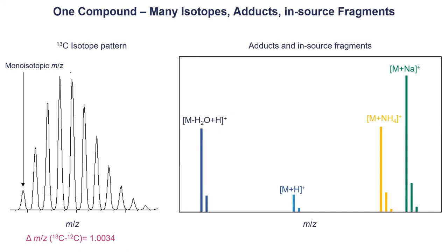And this is also something we need to be aware of, because if you think about it, you have some settings in your spray, like a high temperature. If you have glycosidic compounds, it is very probable that you will lose the sugar and you will only see the aglycone in the end. Of course, if you do the annotation in the end, you will also get to this later. Then you need to be aware that, based on the settings, you can already break your compound into smaller parts, and you will lose the original ion as well.